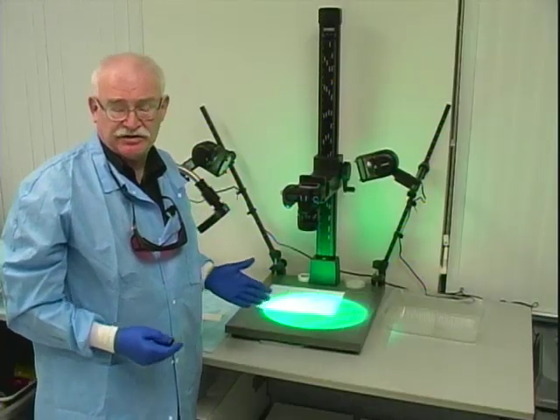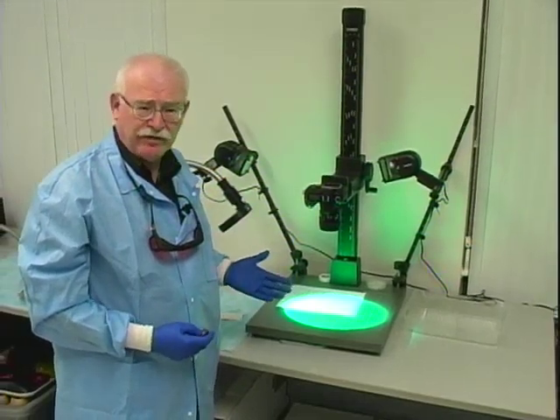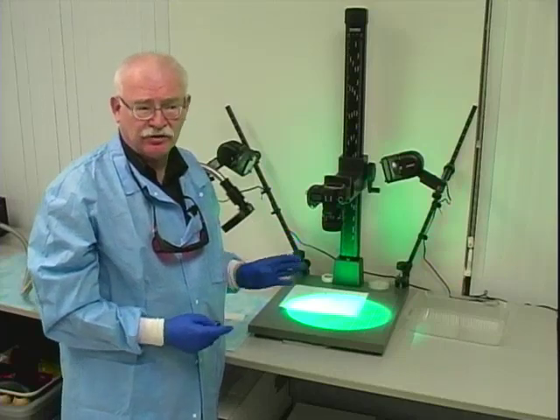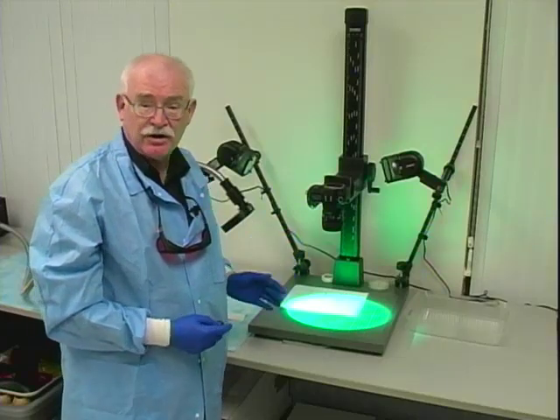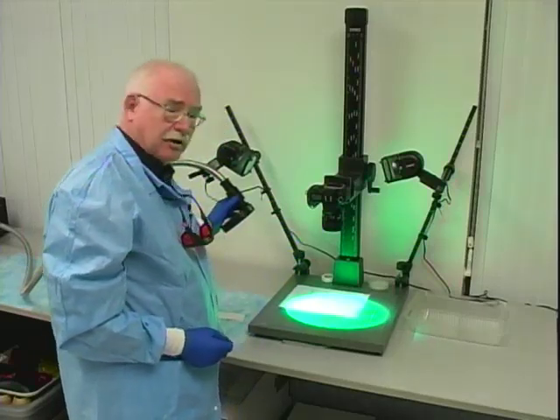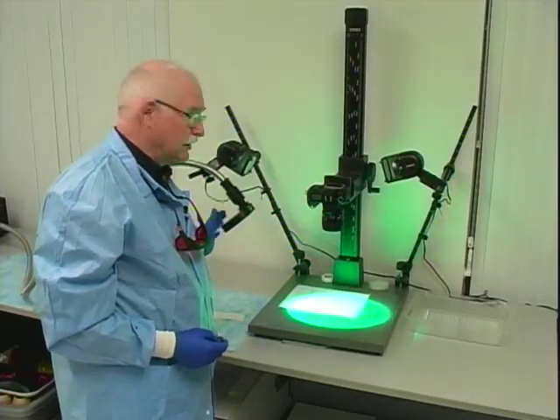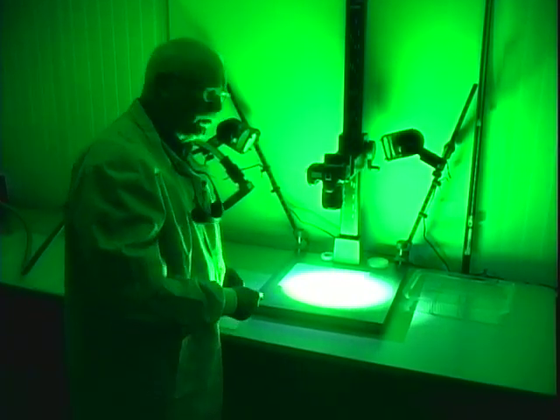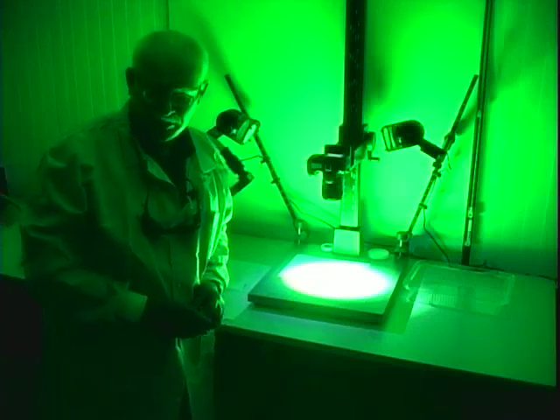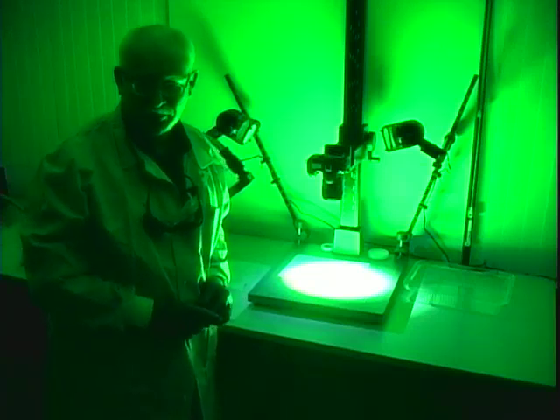The final step in the process is to record whatever we've found. To do that, we place a filter similar to the ones in our goggles on the lens of the camera. We turn the forensic light on and the room lights off, and with the filter in place, we can now see the fingerprint fluorescence. It is then a conventional photograph to capture that image, and we can now move on to the next stage of sequential processing: oil red O.